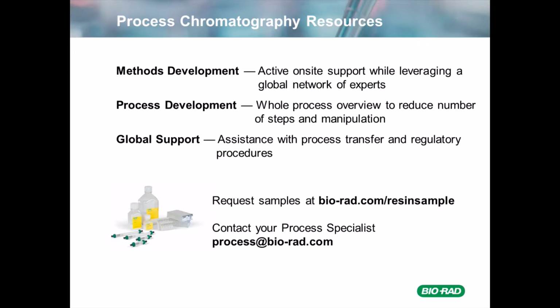Glycine, on the other hand, has been shown to have a modest enhancement effect on hydrophobic interaction, which will allow you to capture the target molecules on the column without using high concentrations of salt. This is very useful if you have a target protein that's not stable in a high conductivity buffer.